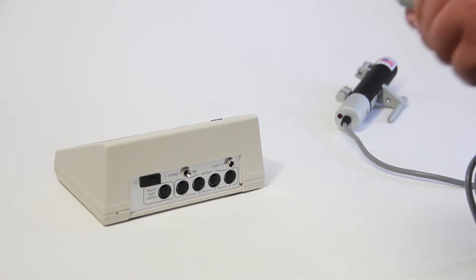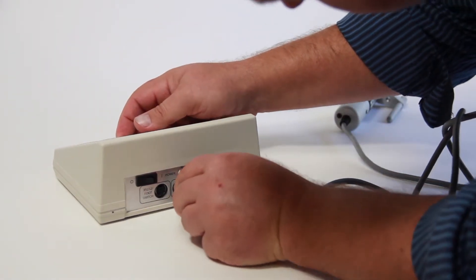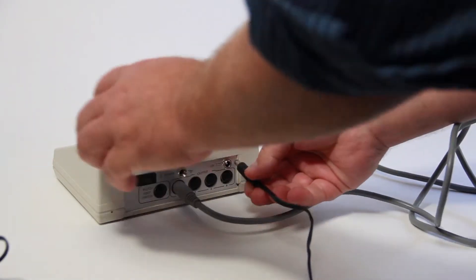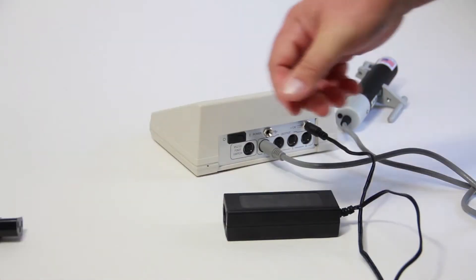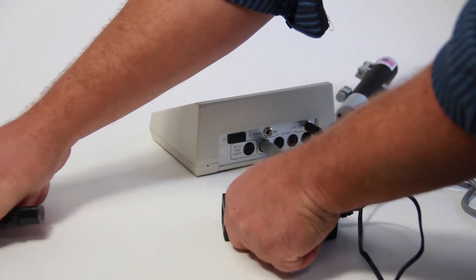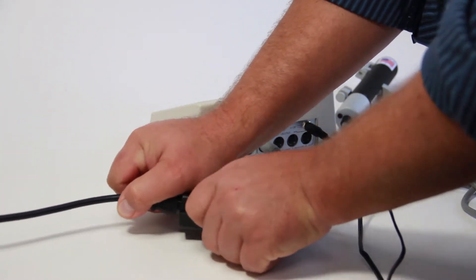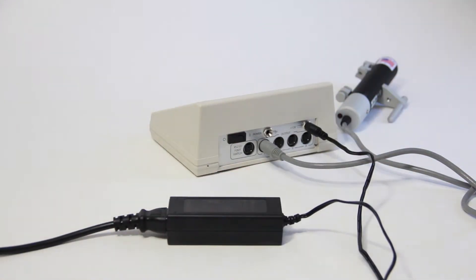To set up the pump, plug the UMP3 cable into an output socket on the back of the Micro Four controller. An important note: up to four pumps may be connected and independently controlled via one Micro Four controller. Next, plug the 12-volt power supply into the rear panel of the Micro Four. The switchable power supply included with the controller automatically senses input line voltage between 100 and 240 volts and converts it to 12 volts. Plug it into an electrical outlet.